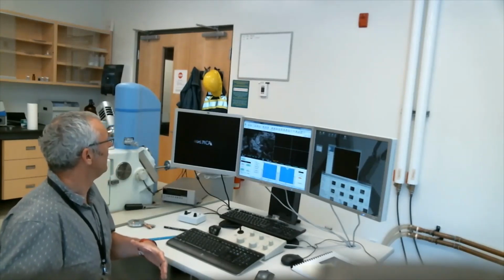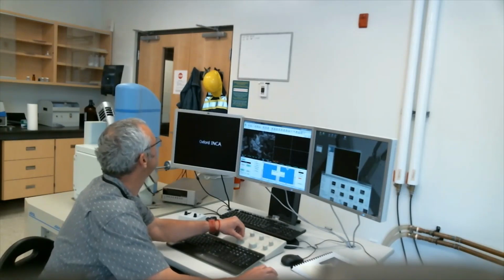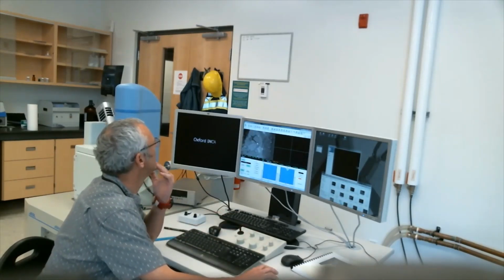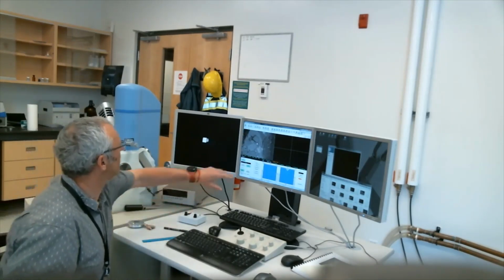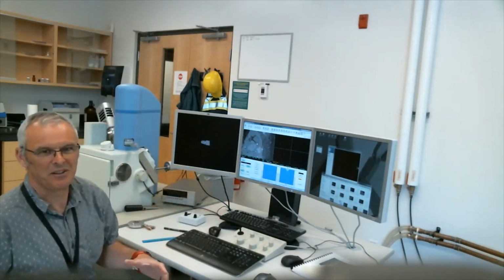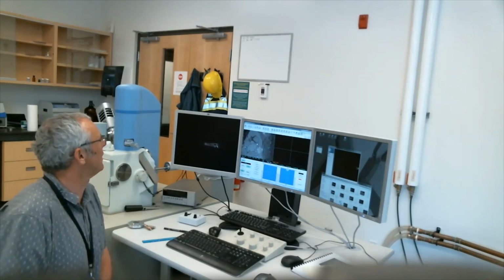You can also see some of these things are much brighter than others. You can see crystals growing on the surface. You can also see some backscatter effect as well. Some of these crystals, like this very bright crystal here, and this crystal here. You can also see the surfaces, and you can see the feature on the surface that we scientifically call gunk, late stage slate gunk growing on crystals. So that's the sample we're looking at. You can see there's a lot of topography on that sample.